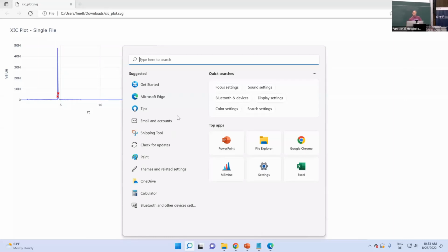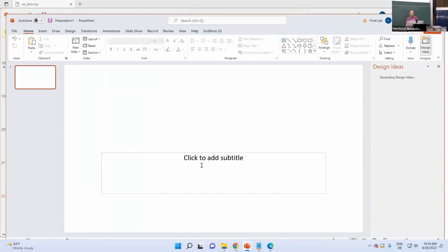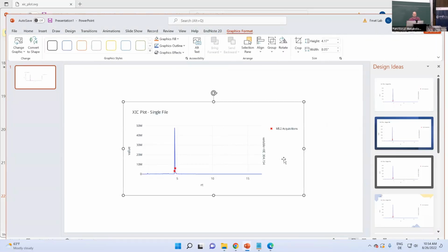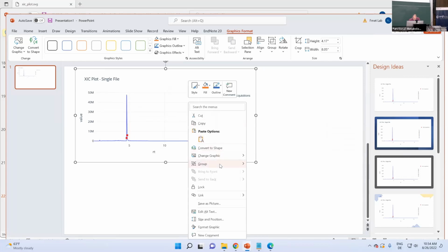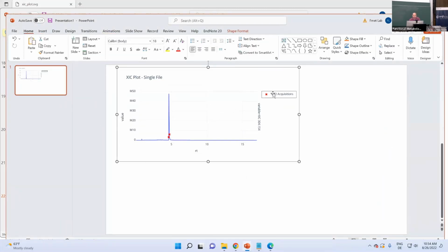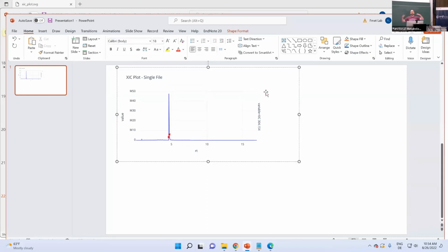For those, PowerPoint actually, we should have, right? So at least that we can all use, and then you can drag and drop it in here and then prepare it for your presentation later. Or again, let's see, group, ungroup, I can disentangle the different elements in here, and then like Allegra did, remove certain things that are not meaningful, and shape this into a way I want to display it.